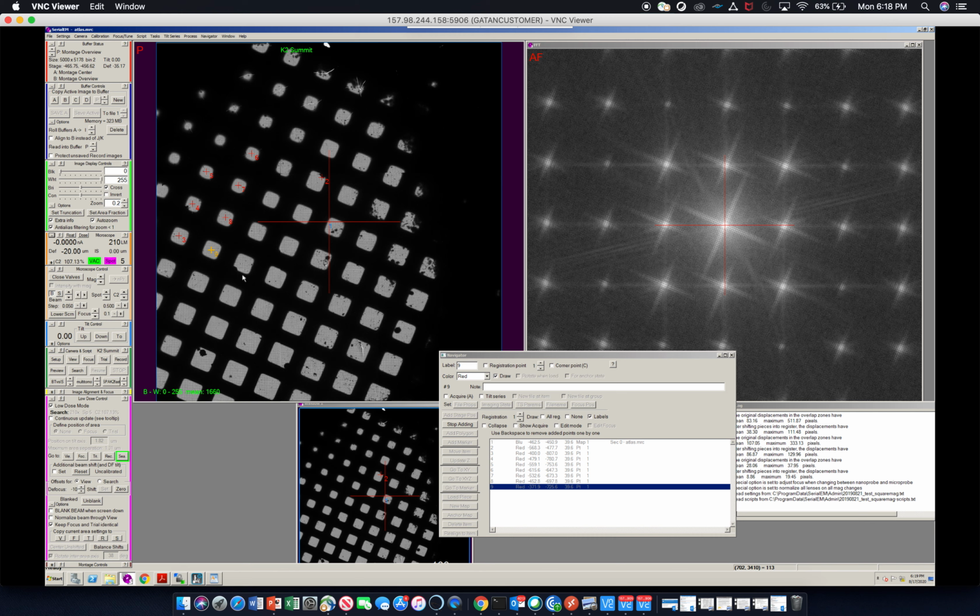And we're just setting up an overnight data collection. So I'm going to just go with, I believe that's 6, 9, I think 10 squares should be enough. And I like to pick one extra actually, just to be safe, just in case. So we'll go with, I don't know, this one. That's a little bit of a jump, but it should be okay. Stop adding.